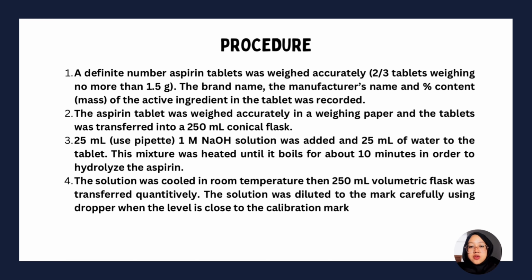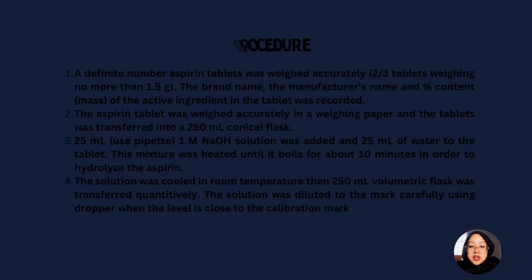Fourth, the solution was cooled to room temperature. Then, it was transferred quantitatively into a 250 ml volumetric flask. The solution was diluted to the mark carefully using a dropper when the level was close to the calibration mark.